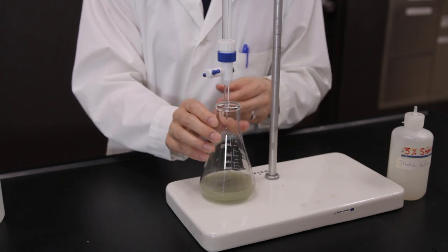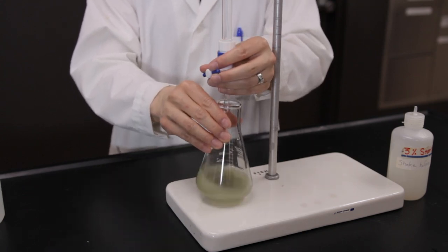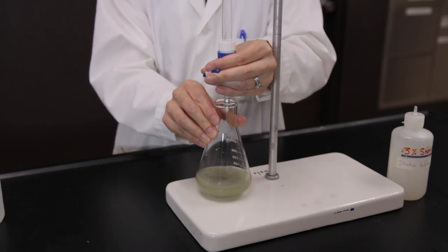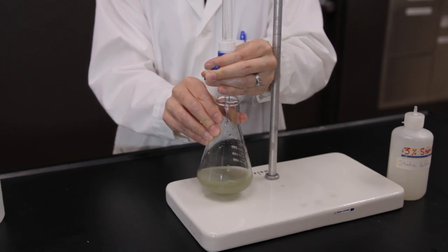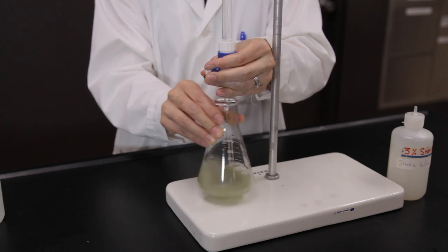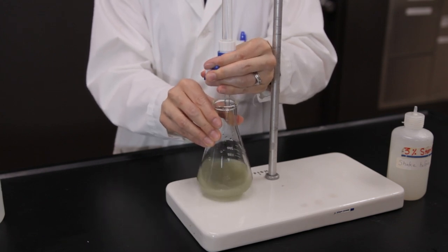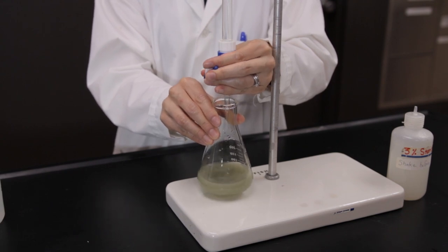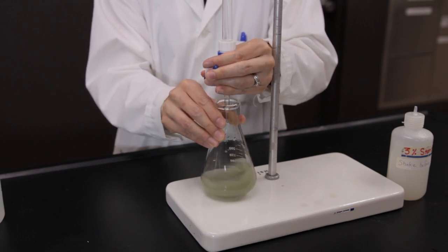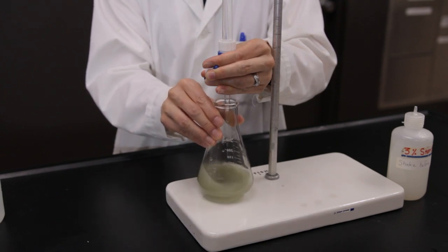Continue the titration by adding more sodium thiosulfate solution dropwise. Add one drop, close the stopcock, swirl the solution, and see if the color disappears. If not, then continue adding the titrant one drop at a time with a break between each addition until the color disappears. You may even have to add a partial drop when you're near the end point.